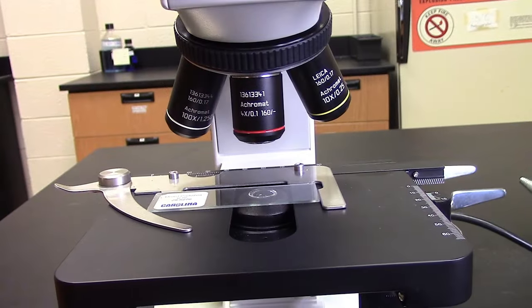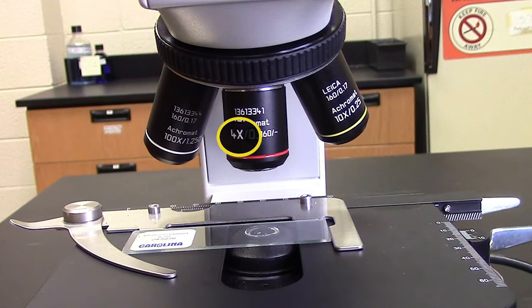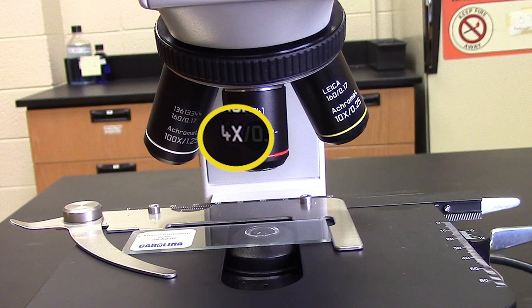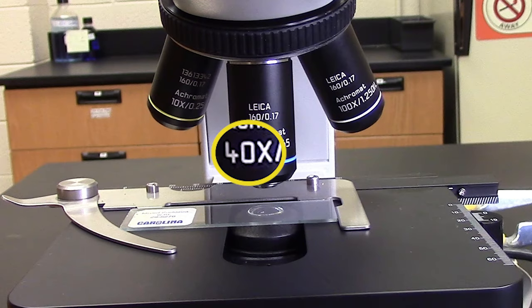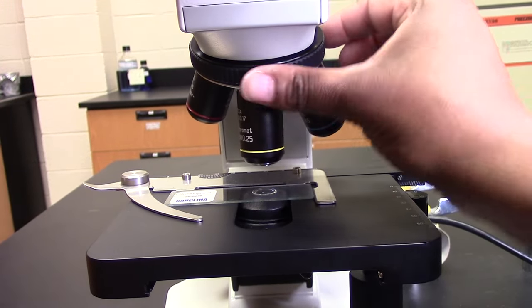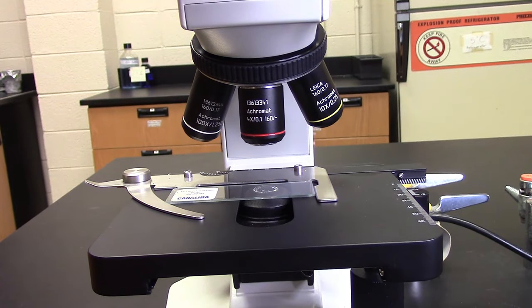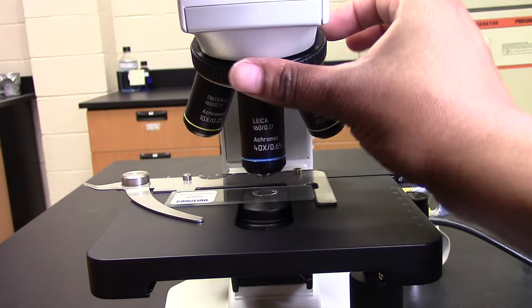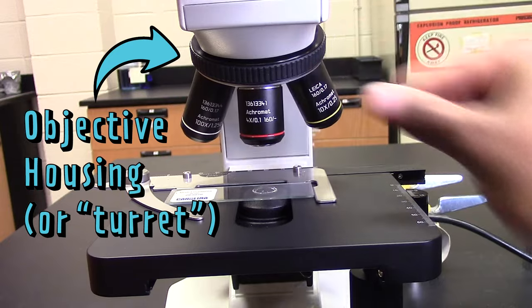These are the objective lenses and they magnify the image in different amounts. It says on the objective how much it magnifies — this one magnifies four times and this one 40 times. It's good practice to always start by using the least powerful objective, which on this microscope is the 4x objective. The objective pointing directly downward is the one in use, and to make sure that's the one you start with, you can turn the objective housing just like this.